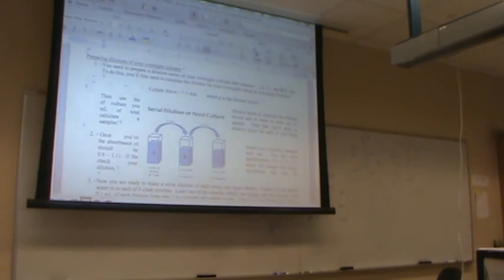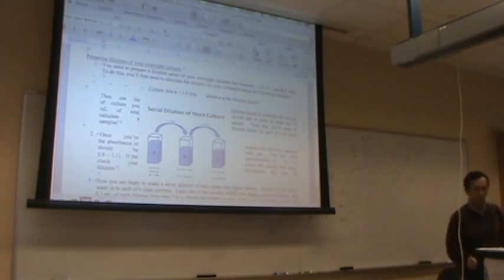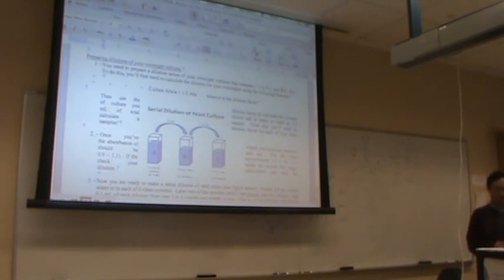100 microliters of cells in this small tube. You mix it up, we need to mix them well, and then you dilute from there, to a full 10-fold dilution, 10-fold, 100-fold. Okay, you should have 9 tubes in front of you, all labeled.